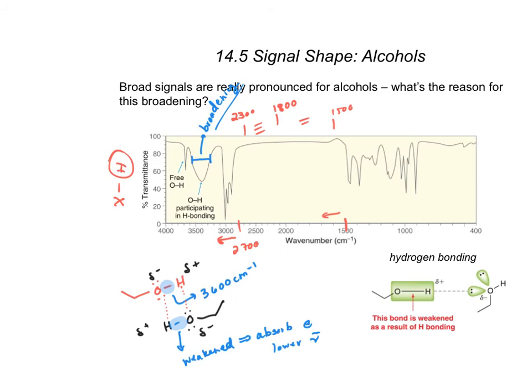So a big telltale signal in the infrared spectrum is a very, very broad signal that hovers about 3500 to 3600 inverse centimeters, right? If you saw this up here, what do you know this is almost 100% due to? This guy specifically, an O to an H. What is an OH called as a functional group?